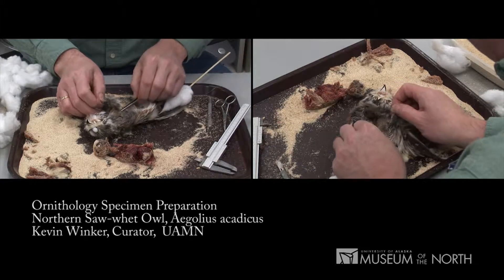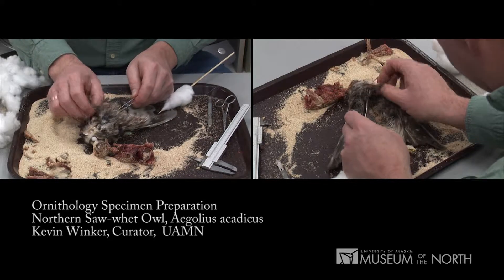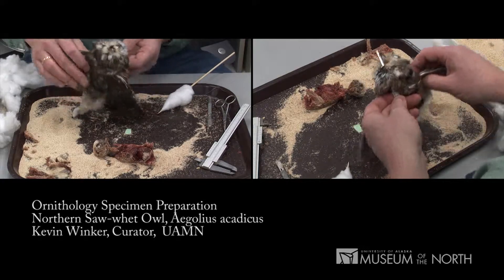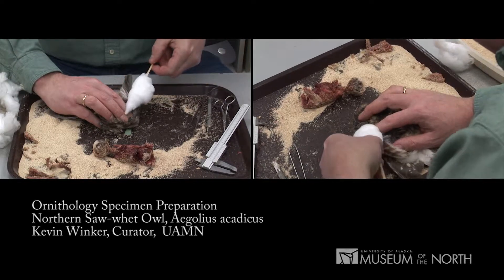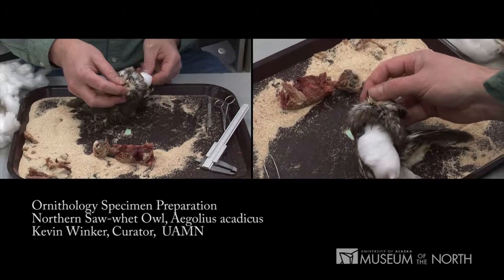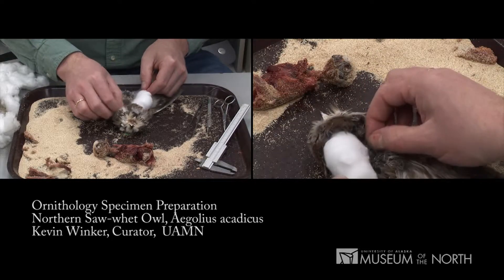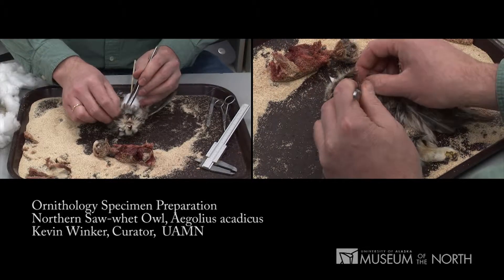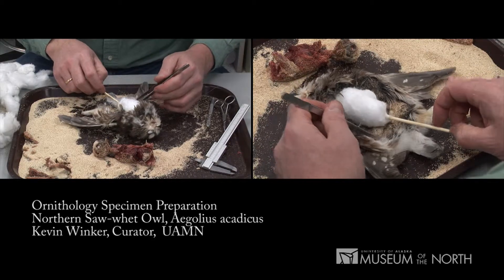Next I will put my forceps up the neck to pilot that sharp pointy stick to the base of the bill, where we'll then insert that point. The forceps are piloting the hole that the stick needs to go into. I insert it so that the point of the stick emerges there, then insert that into the very base of the bill so that the body is anchored at the top — and then it'll become anchored throughout the rest of the skin by sewing this up in a moment. Now I'm simply drawing the skin up over the cotton body that we've made.